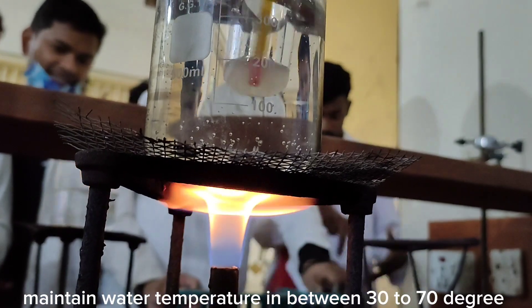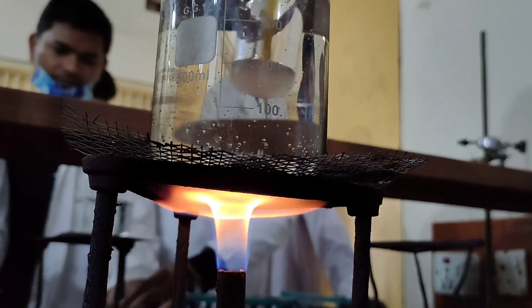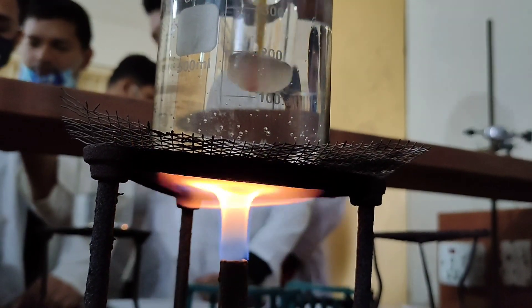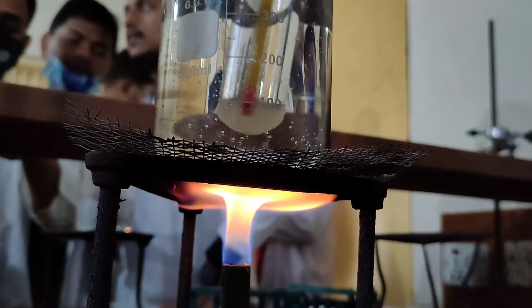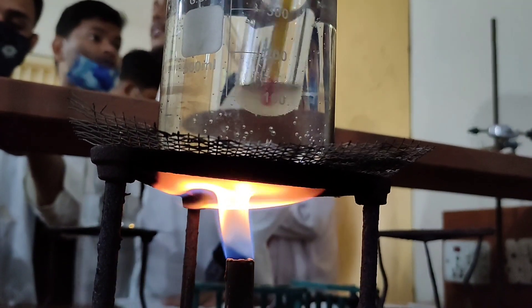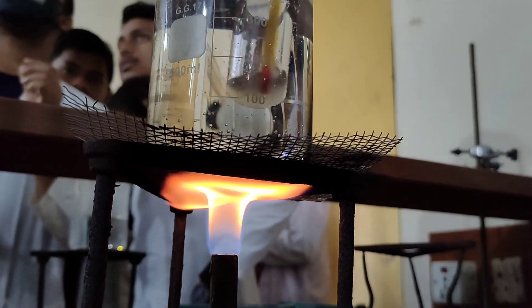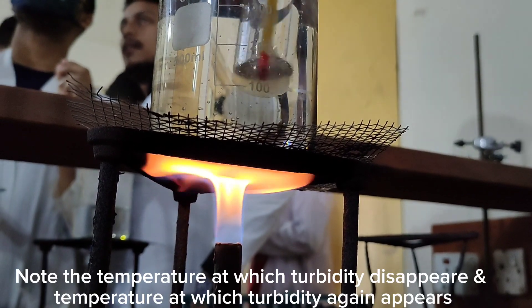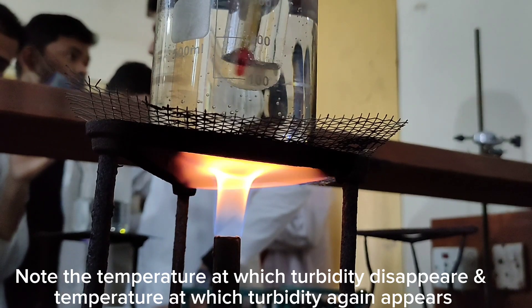Maintain water temperature in between 30 to 70 degrees. Note the temperature at which turbidity disappears and the temperature at which turbidity again appears.